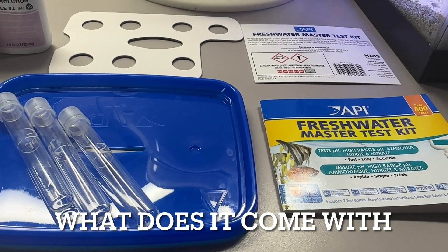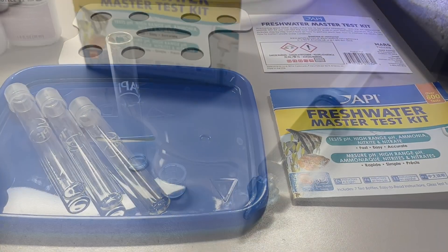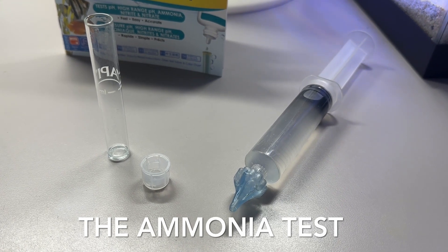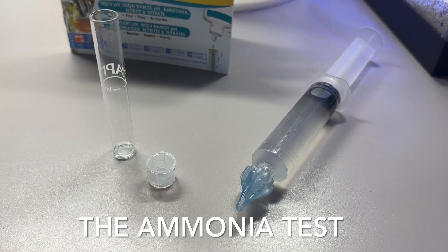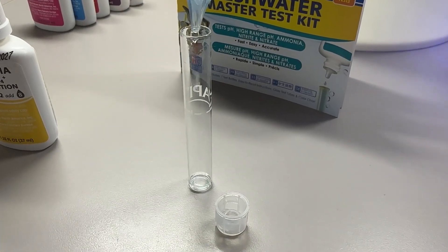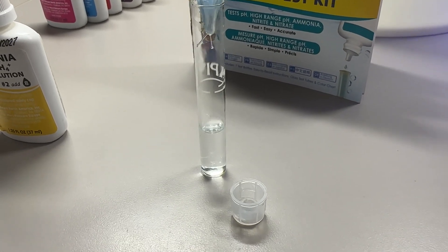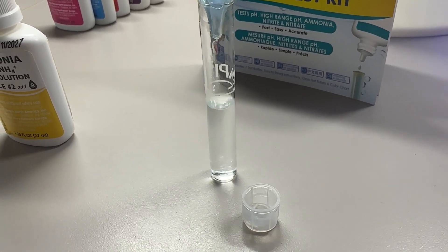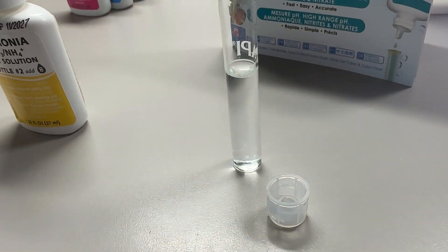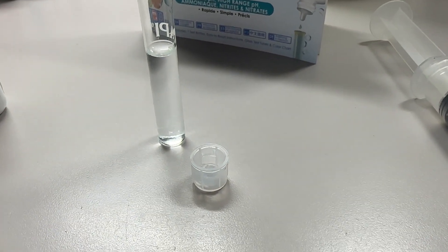Let's start with one of the most important tests: ammonia. We're going to fill the syringe with tank water and then fill the tube to the five milliliter line. It's a lot easier to do it that way than to try to dunk it in the tank.